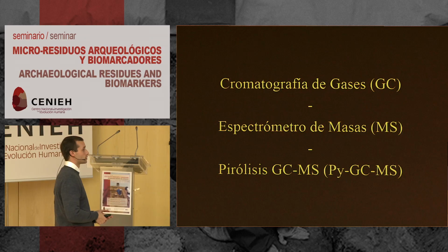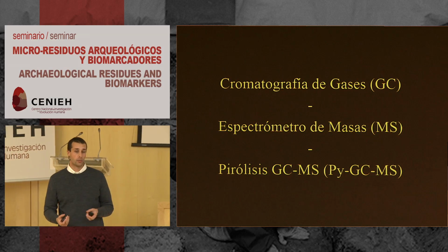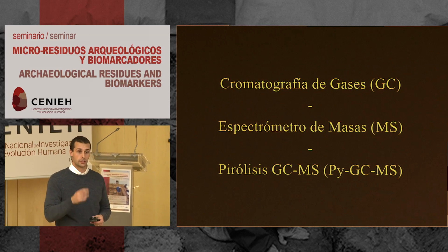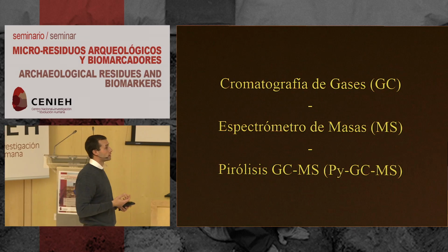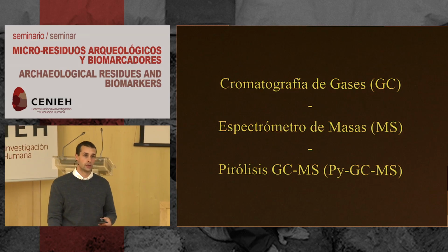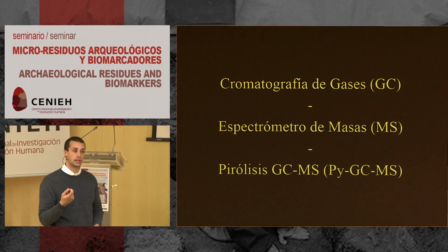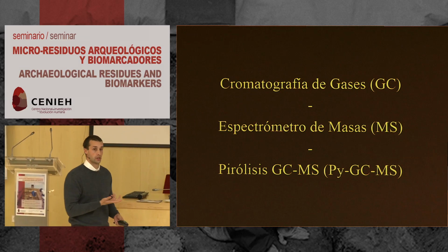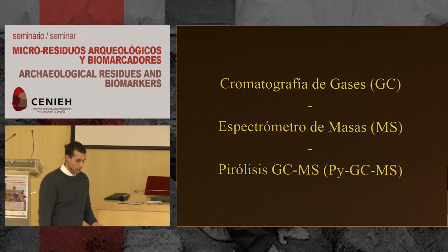Gas chromatography is great for identifying compounds themselves, biomarker compounds, and their abundance, and their relative preservation in sediments from your sites. From there, that can only tell us so much: the source of biomarkers and their preservation. But if we're interested in climate-related studies, we need to understand their isotopes. So we have some techniques that look at isotope mass spectrometry.